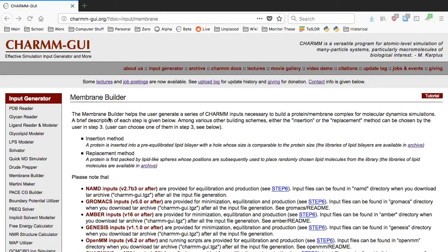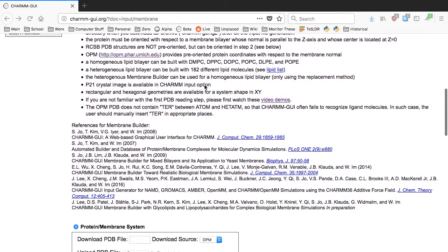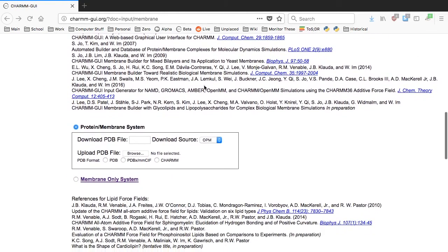BTUB is a TONB dependent E. coli transporter for cobalamin, which is vitamin B12. In this tutorial we will build a BTUB containing E. coli outer membrane system.